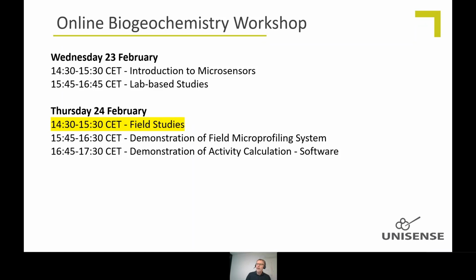So today we will have three presentations. The first will be a PowerPoint presentation about how our equipment can be used for field studies, in situ use, and so on. And then I'll do a demonstration of the field microprofiling systems for how to do microprofiles in sediment. And then I'll do a demonstration of the software and how to use that to convert microprofiles into activities within the sediment.